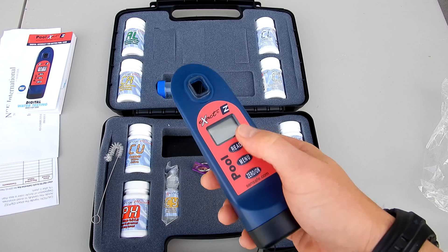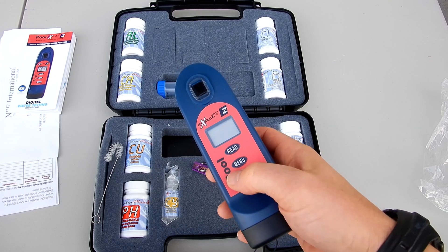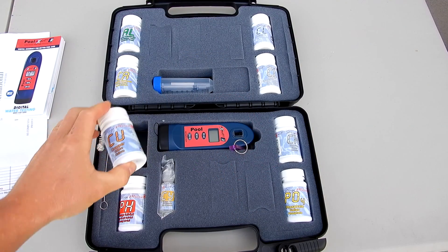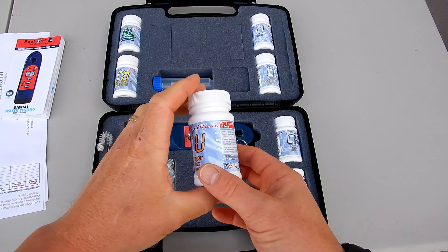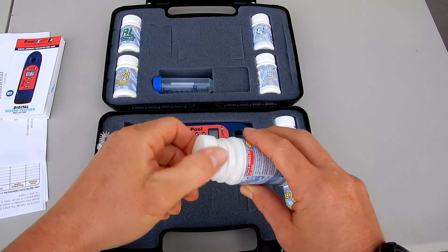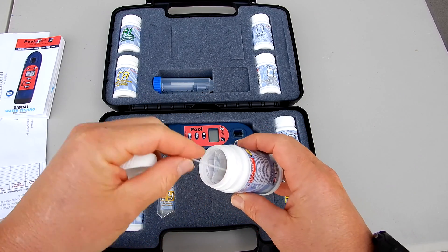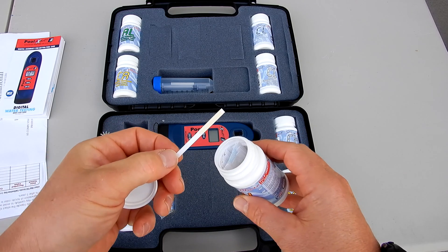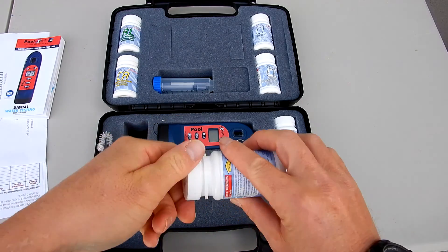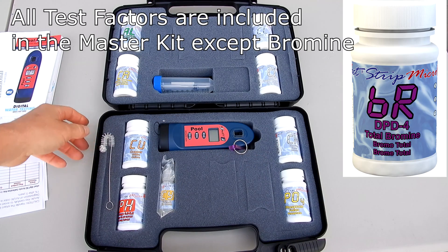For each test factor you can store up to 20 readings under each test factor inside the EXACT EZ itself. This particular photometer uses the EXACT Strip Micro. These are specially formulated strips with reagent on them. These strips are not like standard test strips — they have been formulated to give the EXACT photometer the most accurate reading possible.